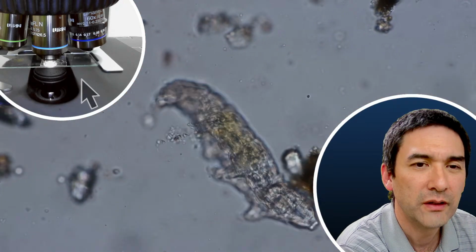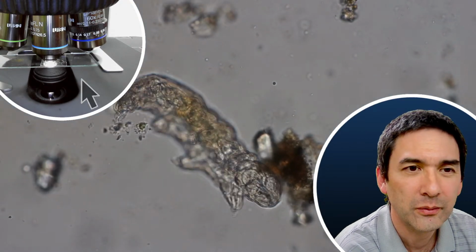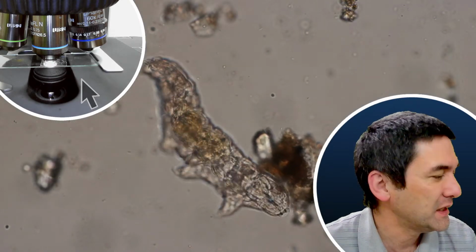So let's give it a slightly more neutral color for a change. And then we're also able to see the digestive system a little bit here. Okay. Yeah, so that's now 400 times.